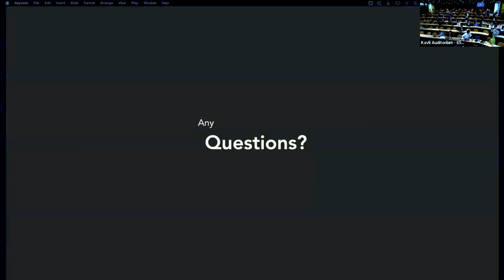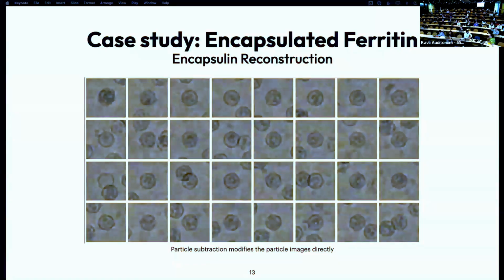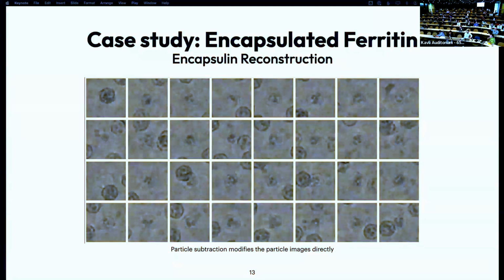Almost all the time, the ferritins are going to be on top of each other, and it's very, very seldom that you'll have one sticking off on the side all by itself. Is it possible that if you looked at the orientations of those 110K particles that finally gave you the right answer, they were all kind of non-superimposed on each other?